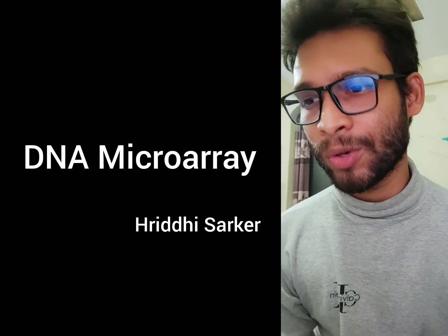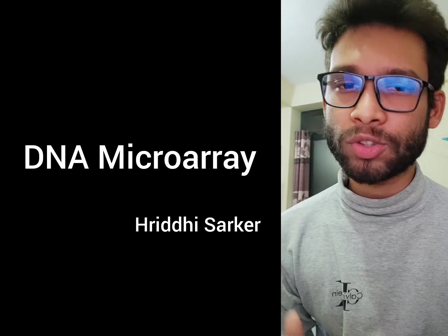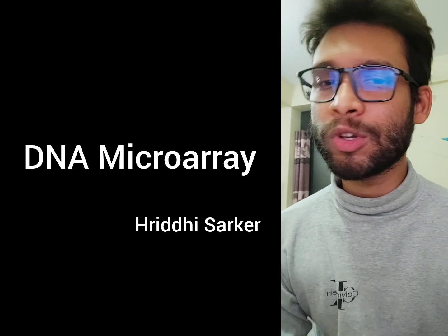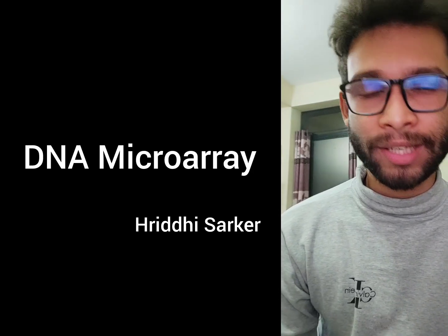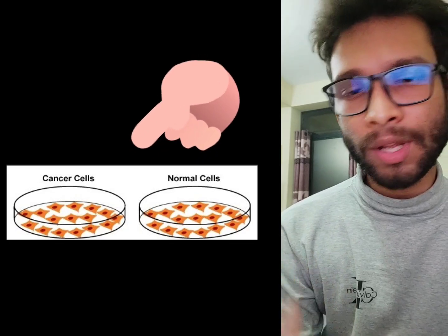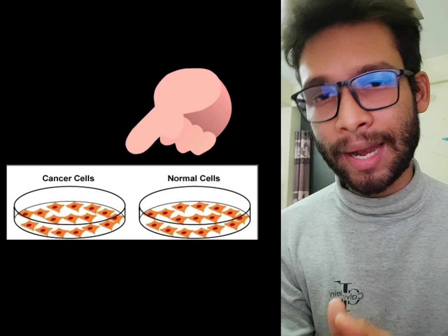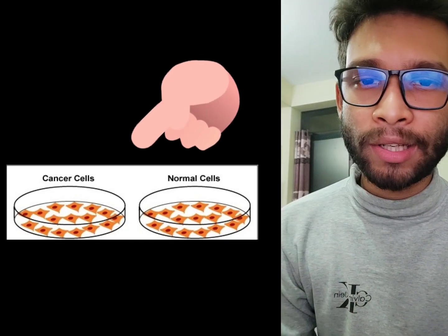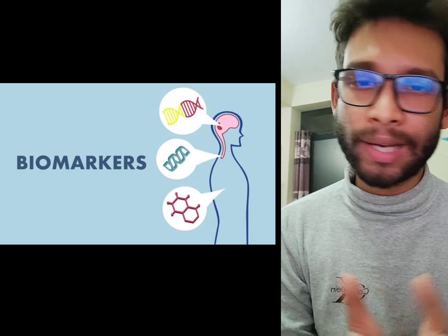However, today we would like to discuss a new interesting topic, and the topic is called DNA Microarray. We will also discuss how it helps to identify differentially expressed genes between two samples. One sample is a control sample or normal sample, and the other sample is a disease sample. This process is really crucial to understand the mechanism of disease, and we can also discover new biomarkers through this process. So this process is really important.